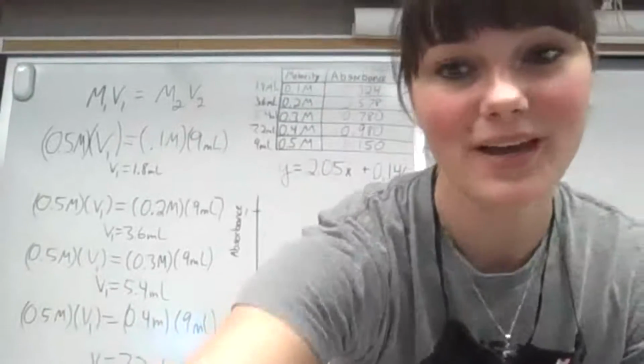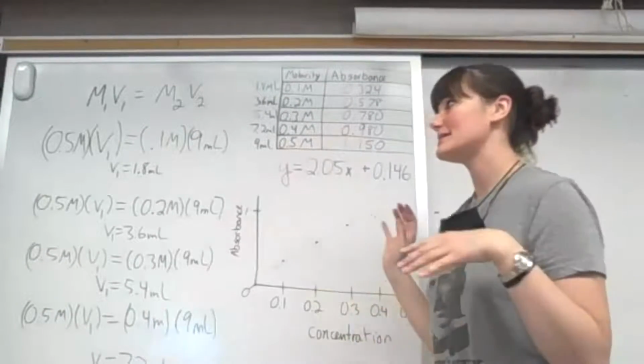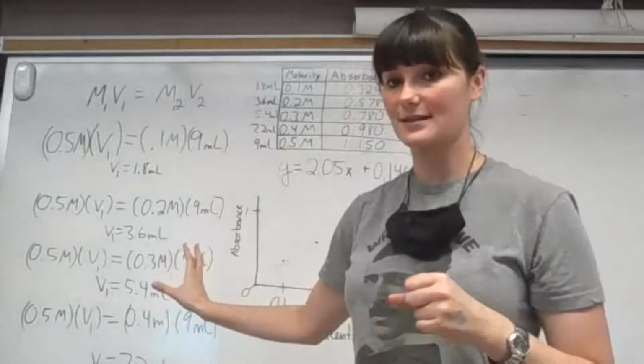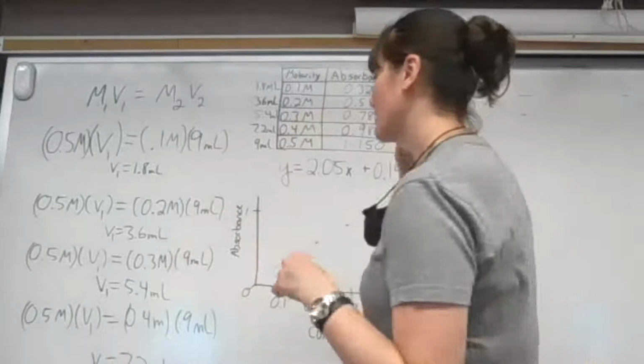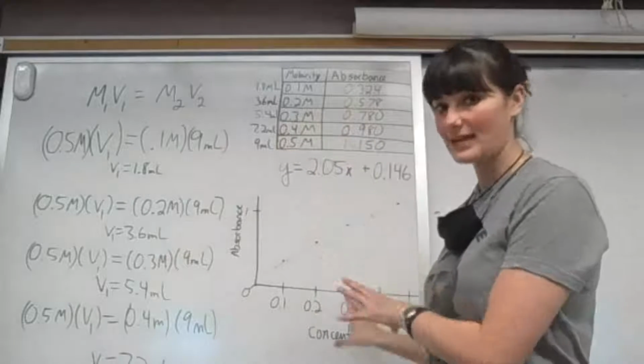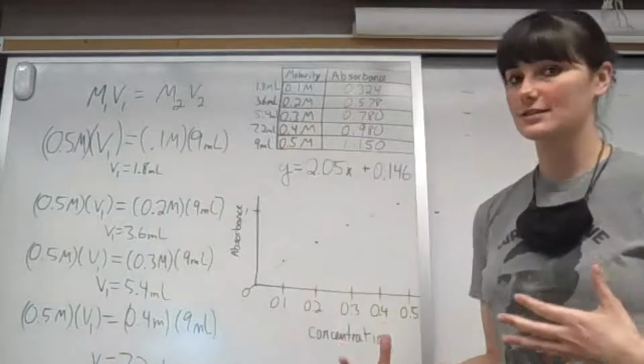friends. So what I did was I went through and I did all the same calculations that you guys did for this lab. I took some absorbance values using the spectrophotometers that we had, made a graph, and I'm going to walk you through every single part of that.